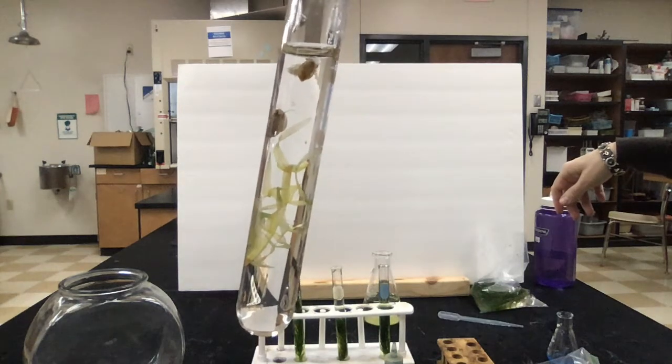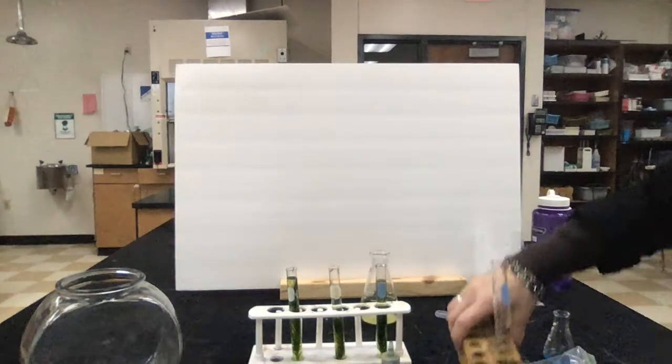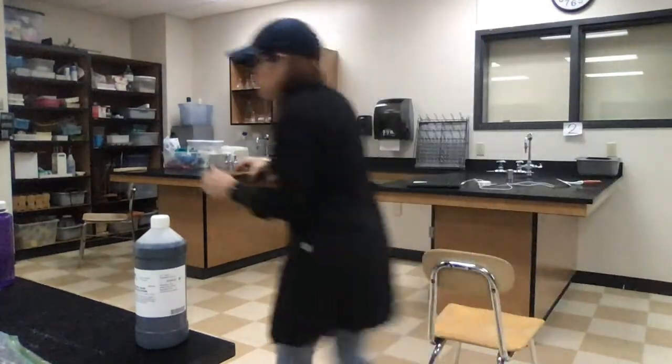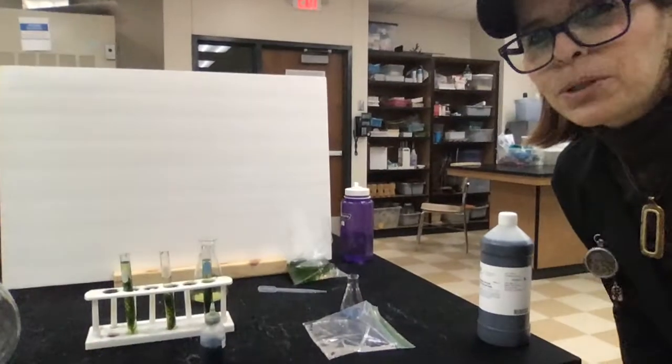So I put them in water that had the plants in it, but now I'm going to put them in the dark so that there's no photosynthesis or anything going to be happening in the light. So I'm going to go ahead and put them in a cabinet in the dark over here. We'll leave them here for several hours. And then we'll come back and we'll test what color that water ends up, whether it's blue or green.